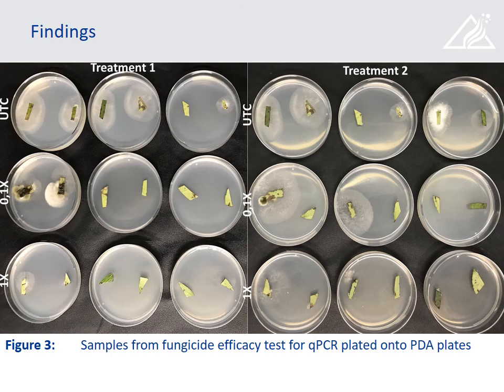So everything has been done. We just need to finalize our qPCR process and run the results.